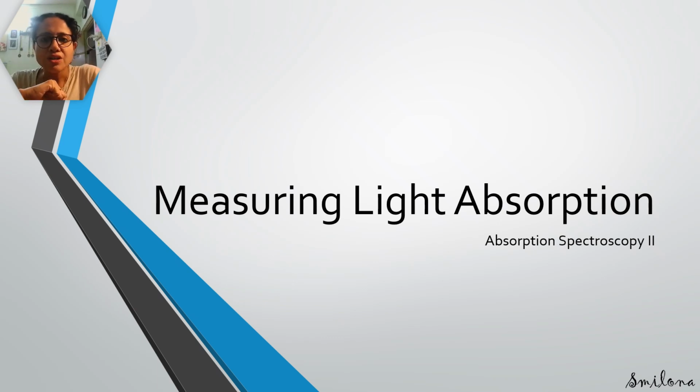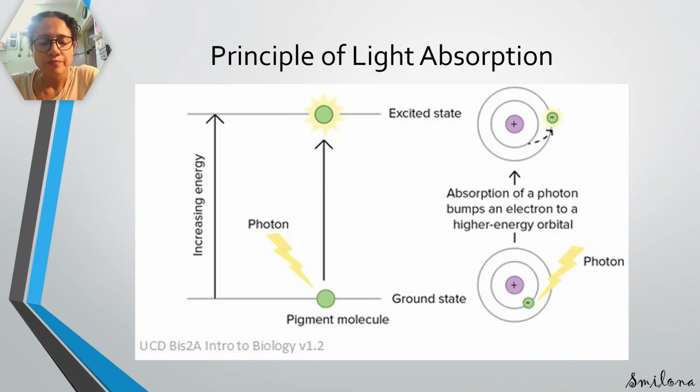Hi students, so this is a follow-up video of my previous video on lights and molecules where I discussed how light interacts with matter and how light is absorbed by molecules, and this is what is responsible for giving the molecules or a solution's matter their color. From the previous video, what I explained was the principle of light absorption.